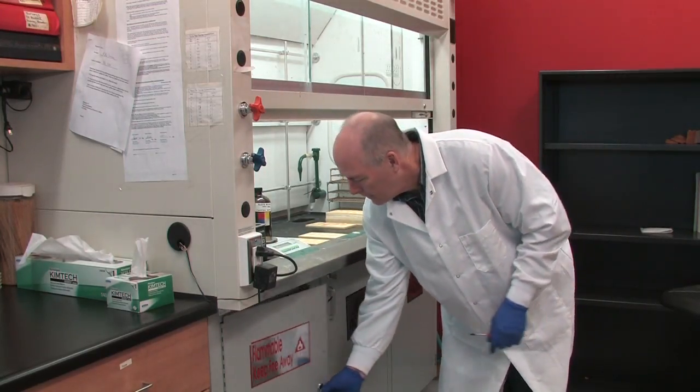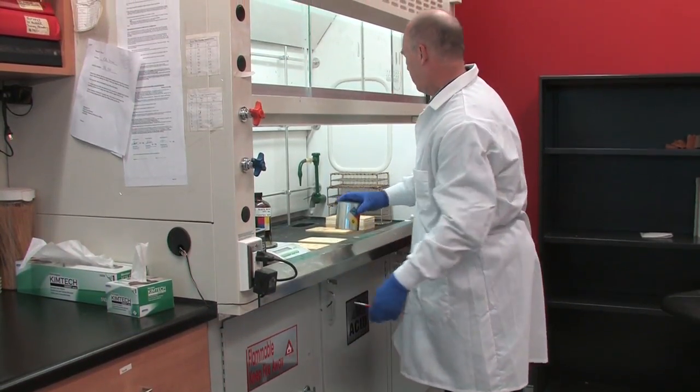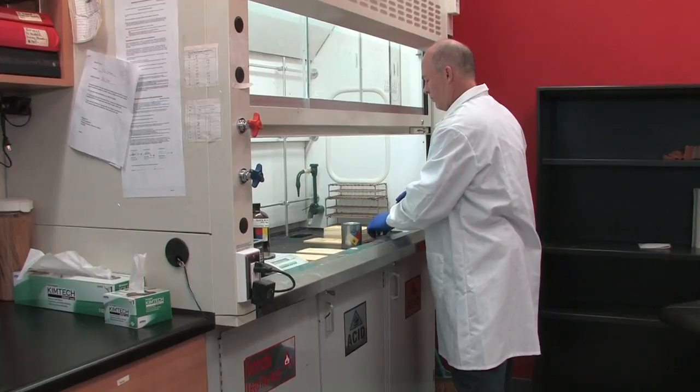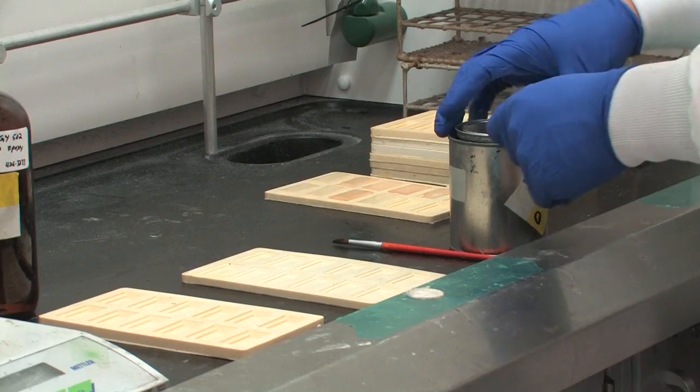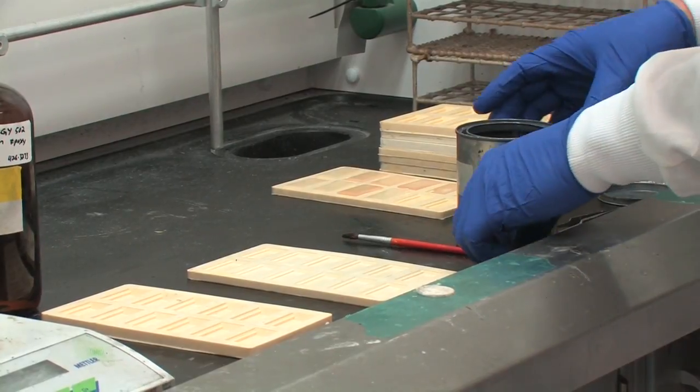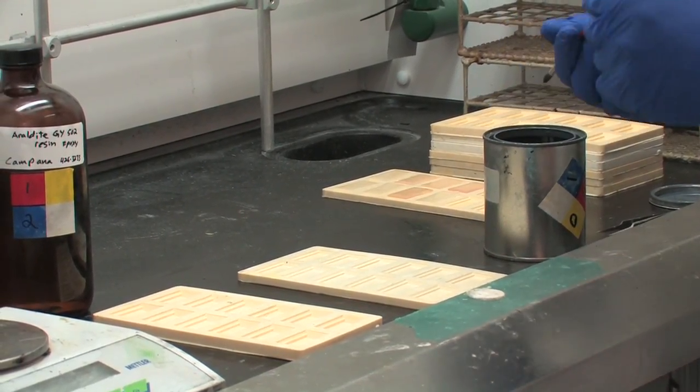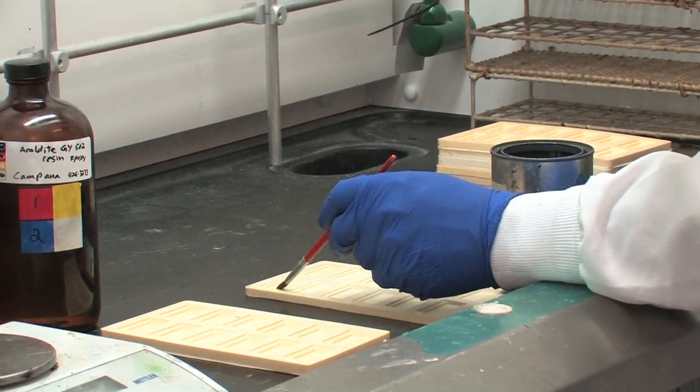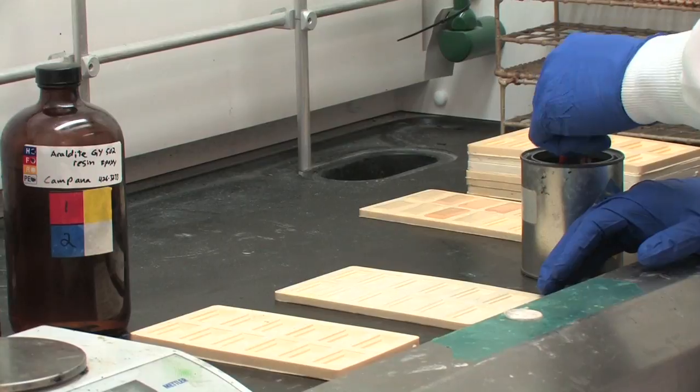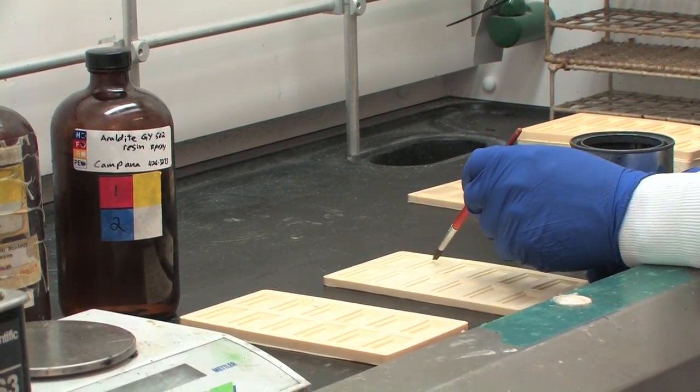Using a small paint brush, paint the wells with free coat, a releasing agent. The free coat is stored under the fume hood with the epoxy resin and hardener. Open the can and apply a thin layer of the agent sparingly in the wells of the molds. Be sure to use protective gloves when handling the releasing agent and the epoxy.